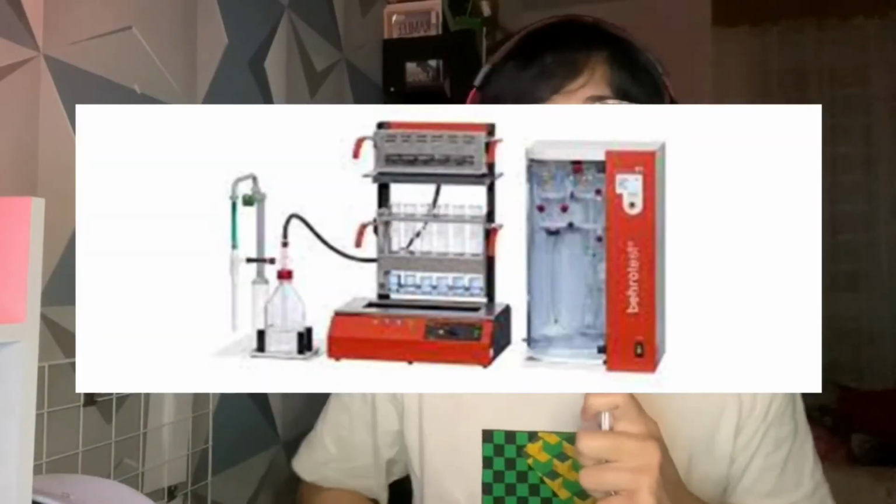The Kjeldahl method was developed in 1883 by a brewer called Johann Kjeldahl. The protocol is built on the principle that strong acid helps in the digestion of food, so that it releases nitrogen, which can be determined by a suitable titration technique. By observing the nitrogen concentration of the food, the amount of protein present is then calculated.